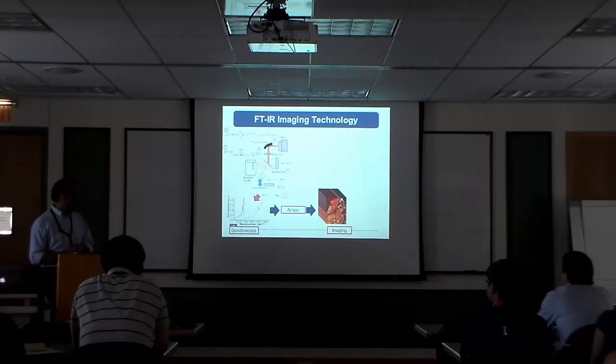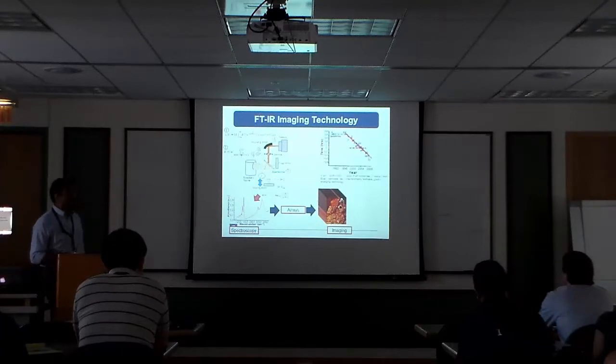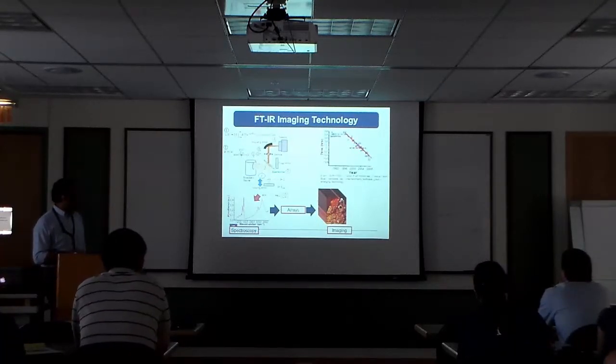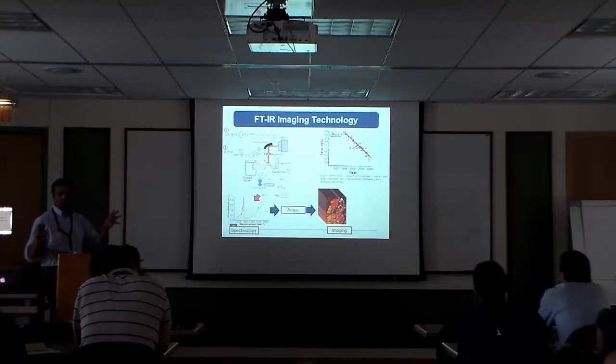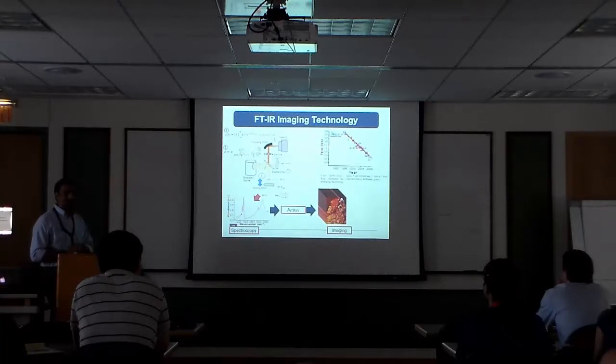So now that you can acquire imaging data, what do we do with it? Oh, before I go there, let me give you one more point of reference. This is just an interesting side story, but when I began as a grad student, if you wanted to image a 1 centimeter by 1 centimeter area with certain signal to noise ratio and certain spectral resolution under certain parameters, it would take you 7 years. Okay? Now in my lab, we can do that in about 20 seconds.